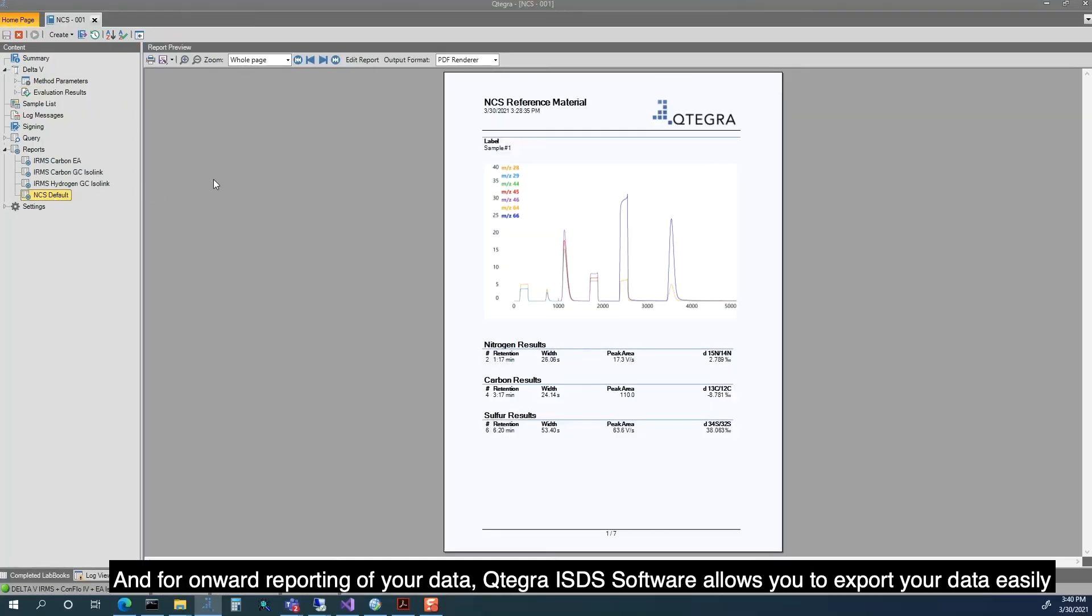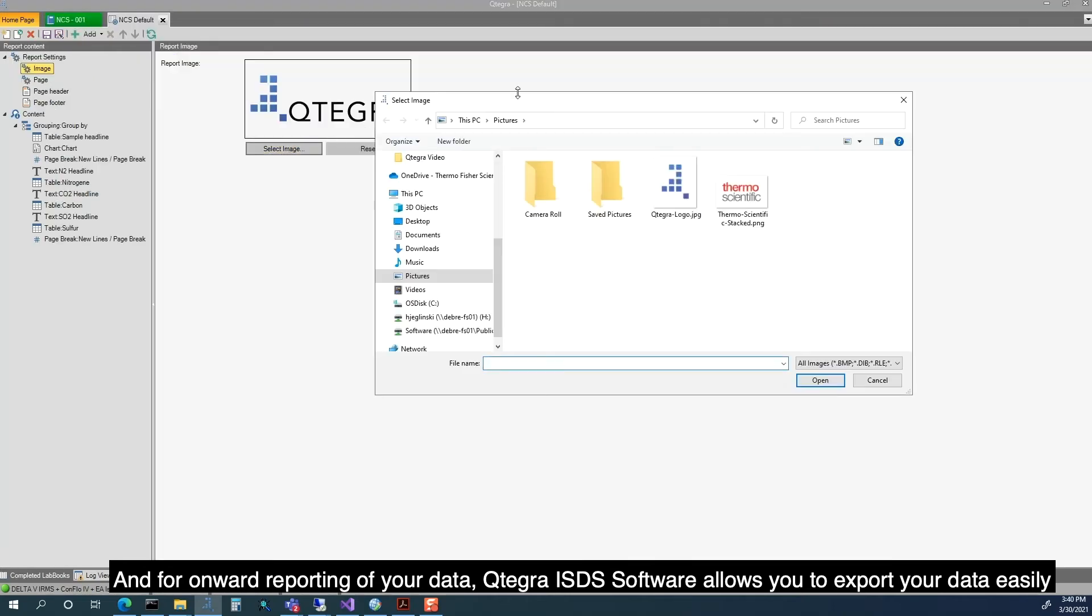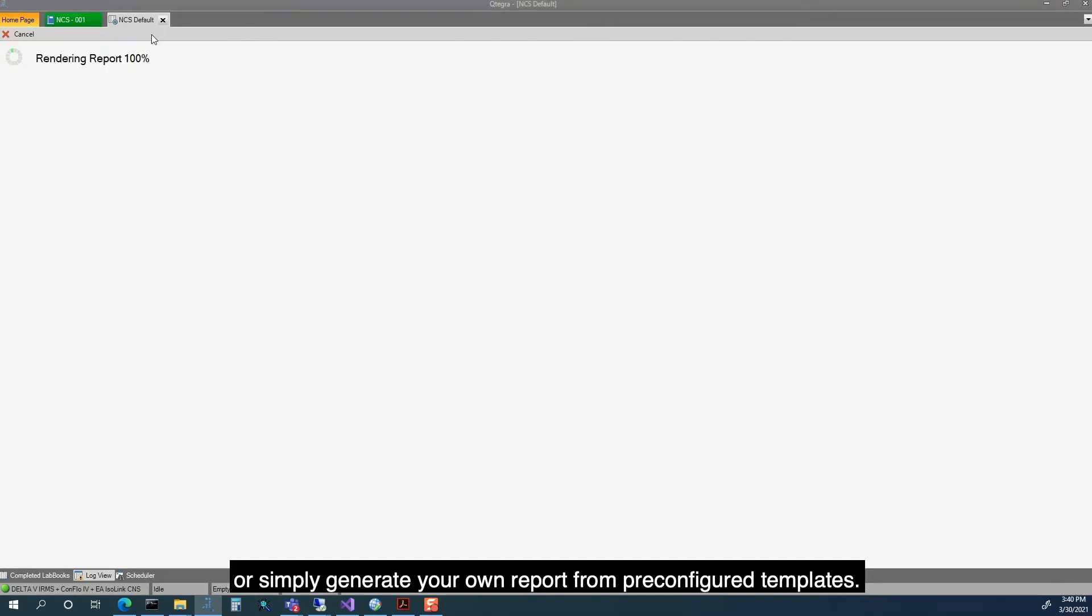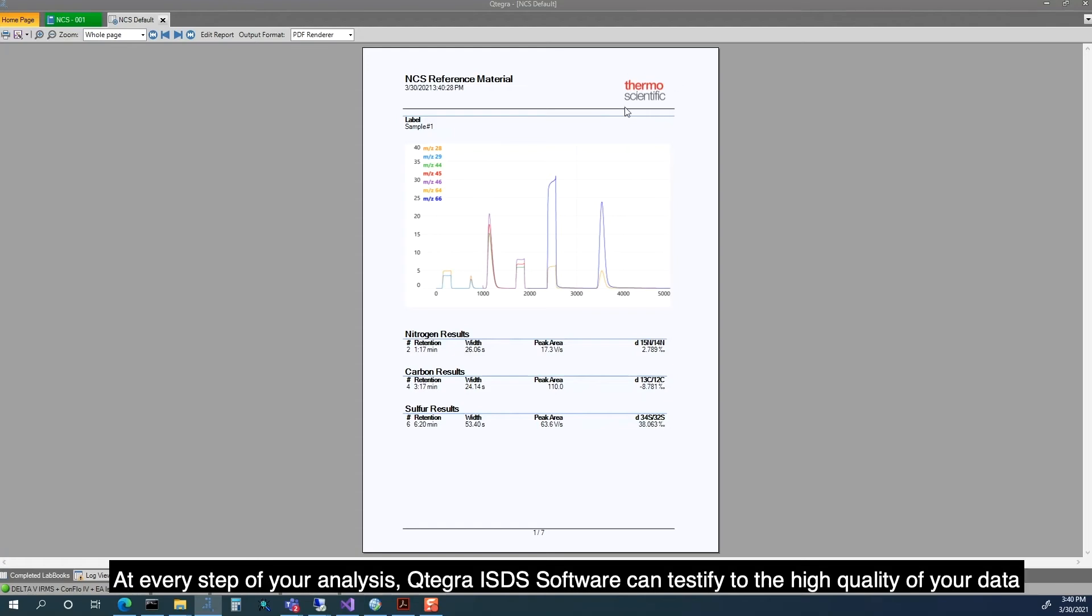And for onward reporting of your data, Qtegra ISDS Software allows you to export your data easily or simply generate your own report from pre-configured templates.